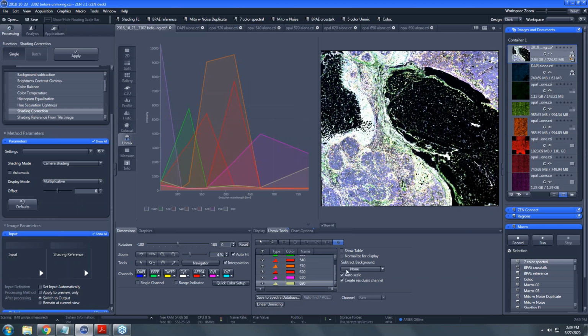You're always going to get something. And it's pretty easy to get something that looks good. Okay, so why is that a problem? Well, you don't know how accurate you are if you don't look at the residuals channel. If it gives you an image that looks good and you're happy with it and you go and you publish it and you don't realize that it's actually entirely inaccurate, it just happens to correspond to what you wanted to see, that's not really a good situation.